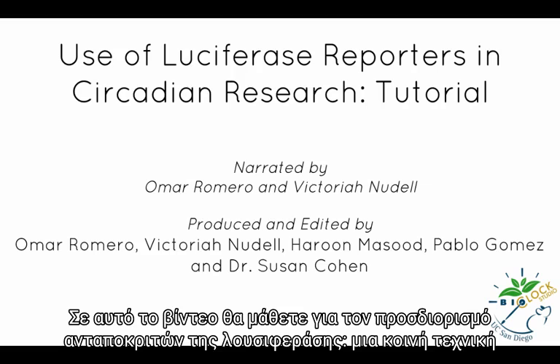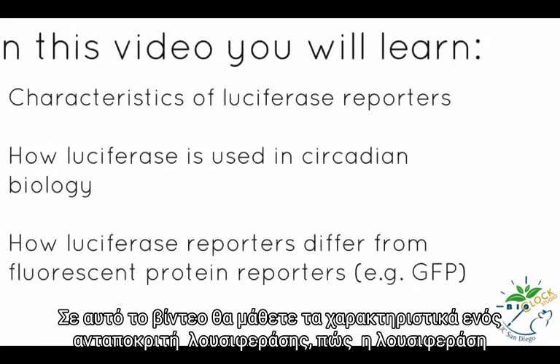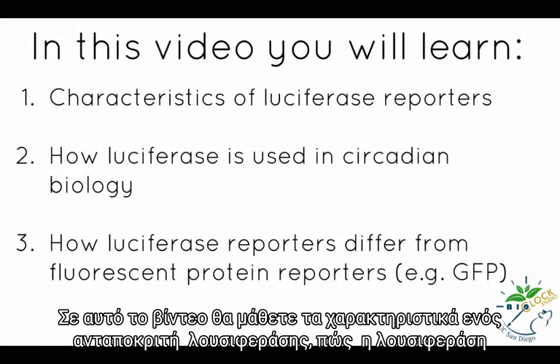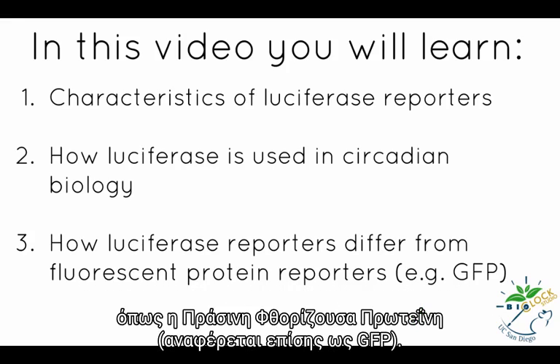In this video, you are going to learn about the Luciferase reporter assay, a common technique utilized to study various biological responses, such as circadian rhythms in many organisms. You will learn the characteristics of a luciferase reporter, how luciferase is used in circadian biology, and the difference between luciferase reporters and fluorescent protein reporters, such as green fluorescent protein, also referred to as GFP.